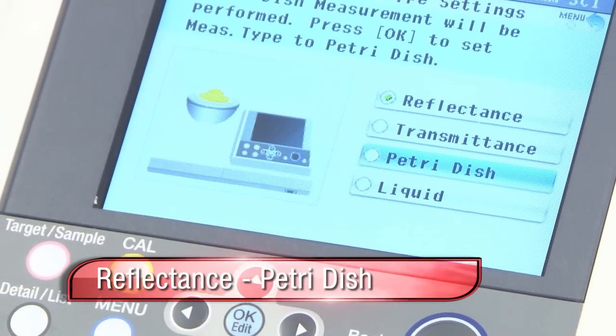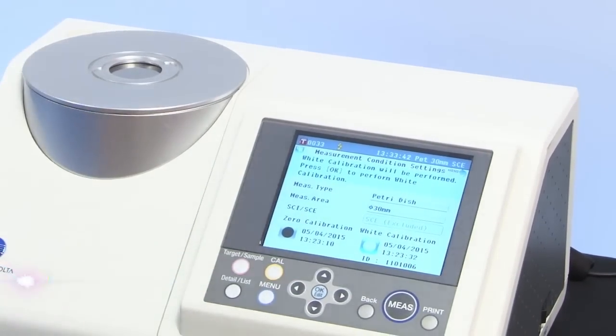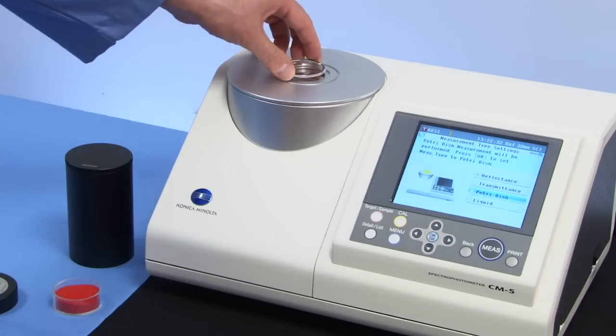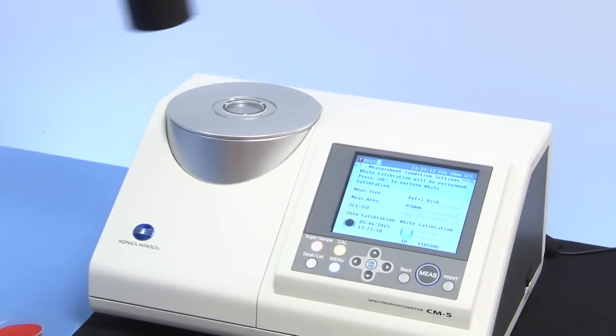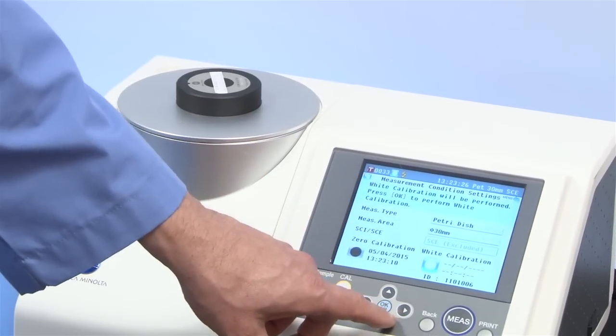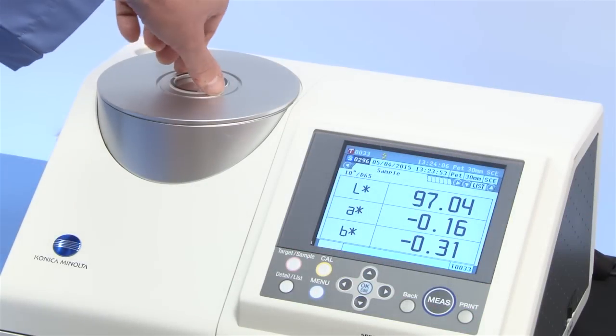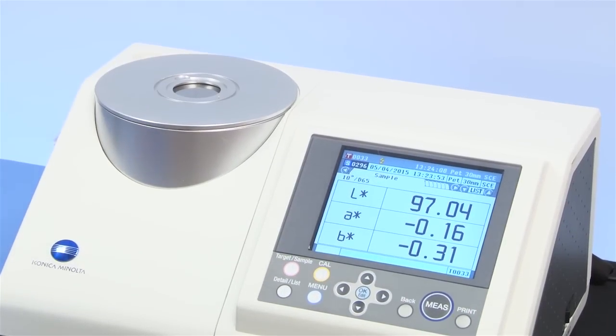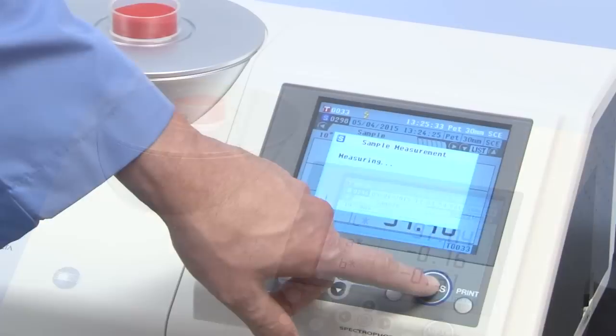To perform a reflectance measurement in petri dish mode, put the special target mask in place followed by the glass accessory piece. Perform zero calibration, and then an external white calibration through the glass piece. This will normalize the instrument when measuring samples through a petri dish. Proceed to measure your targets and samples in reflectance mode as normal.